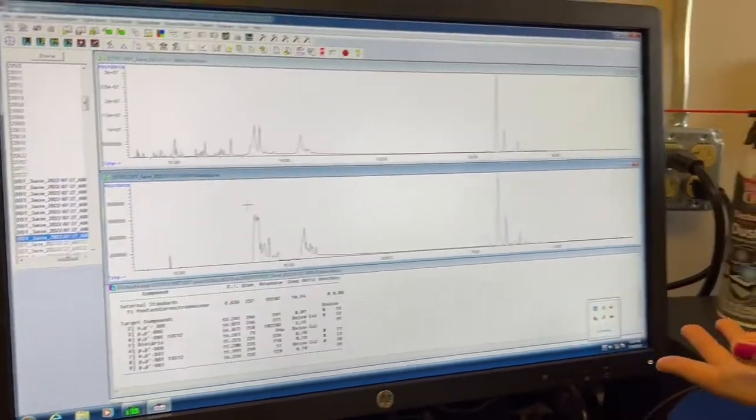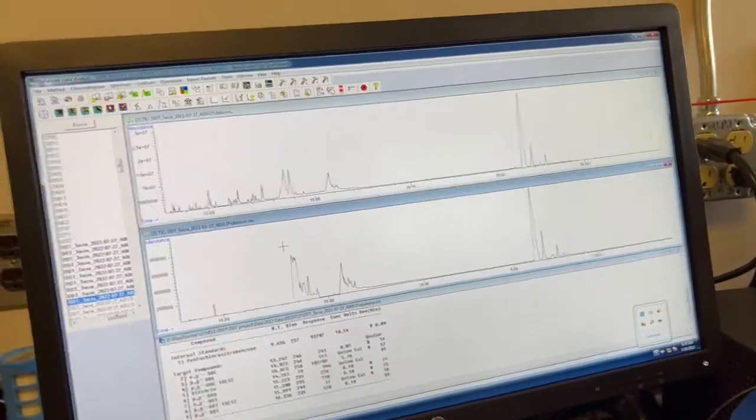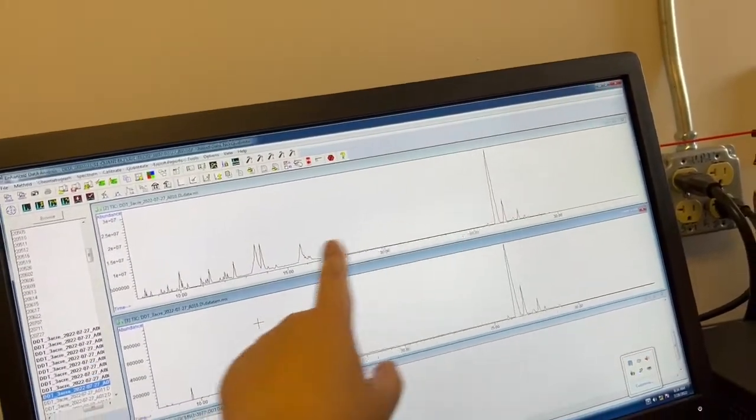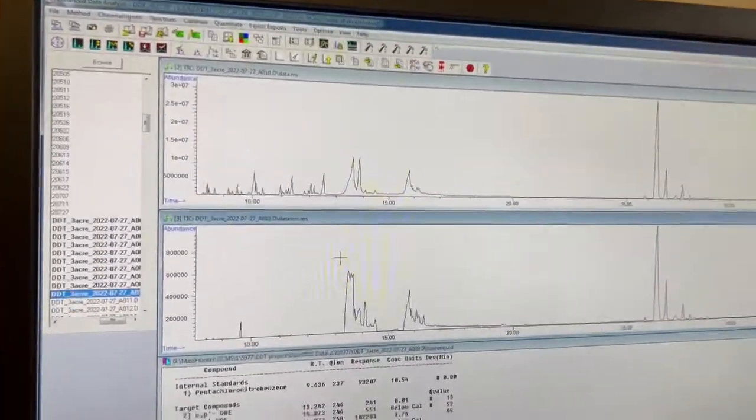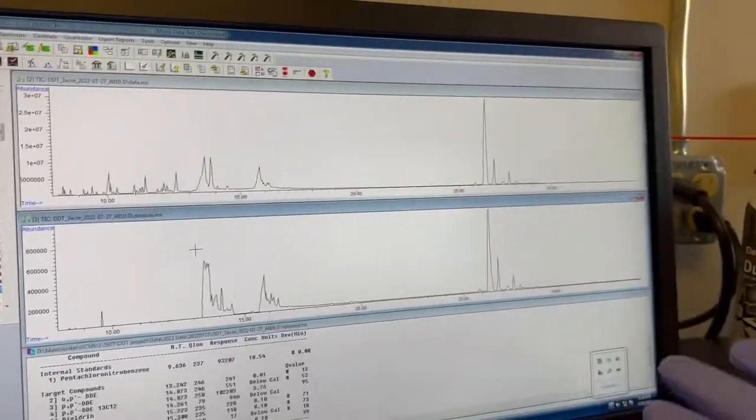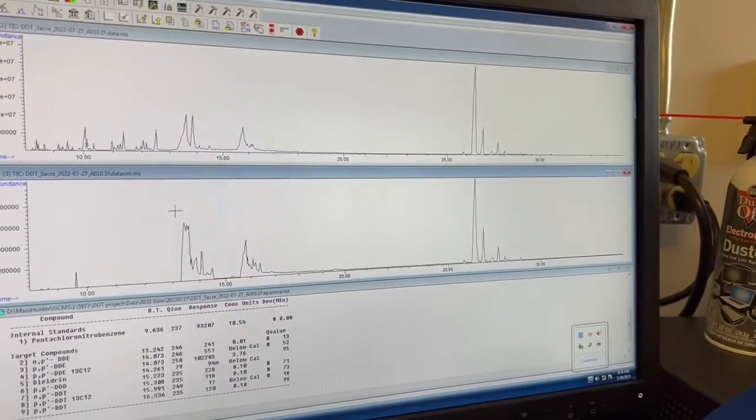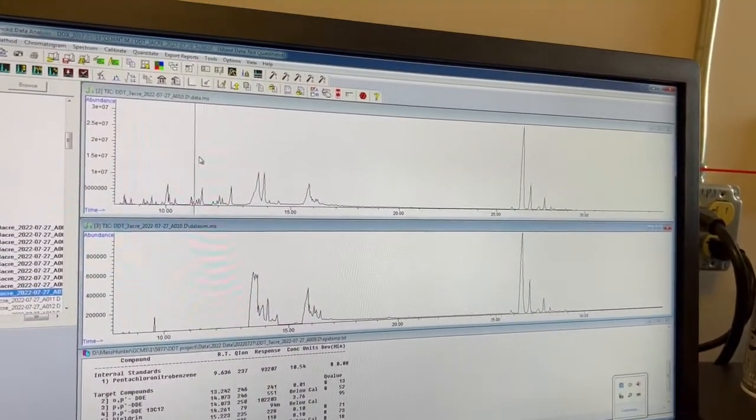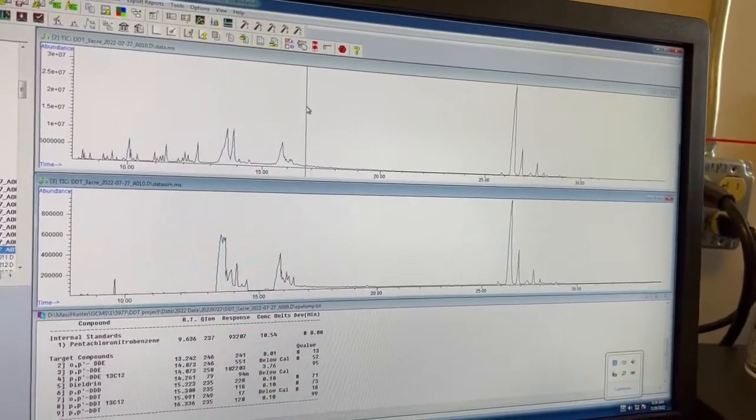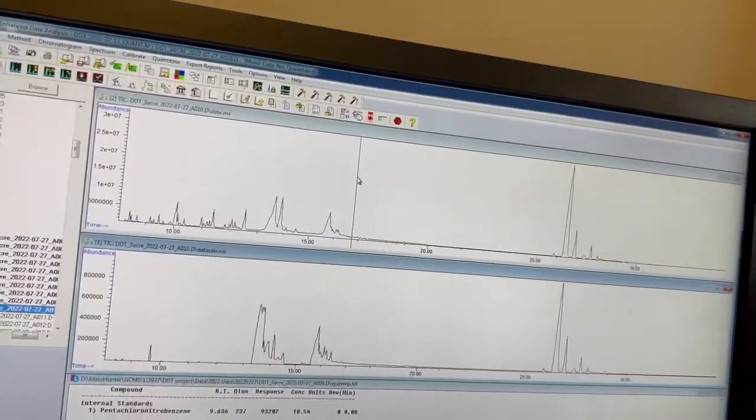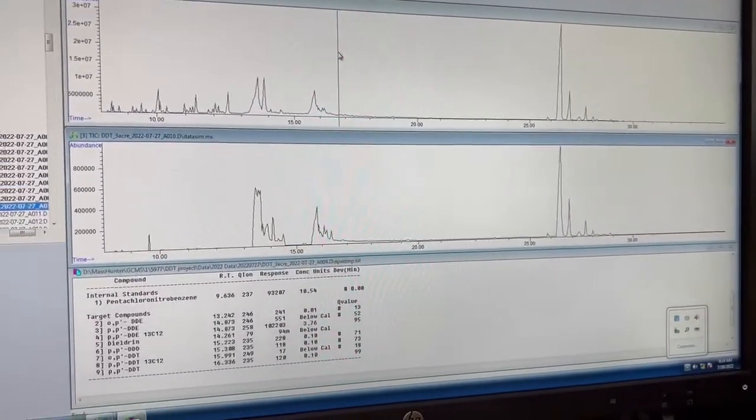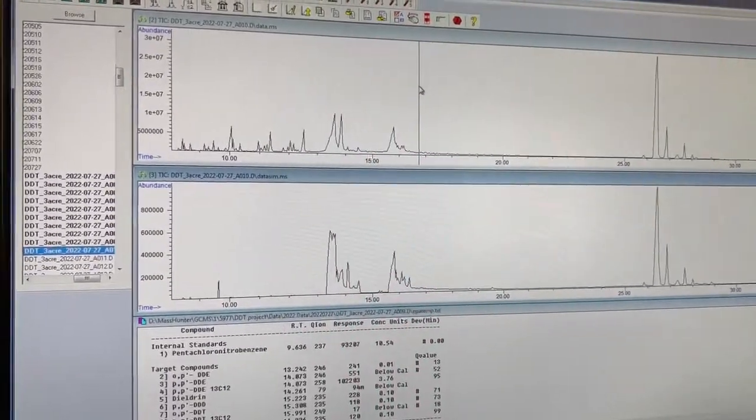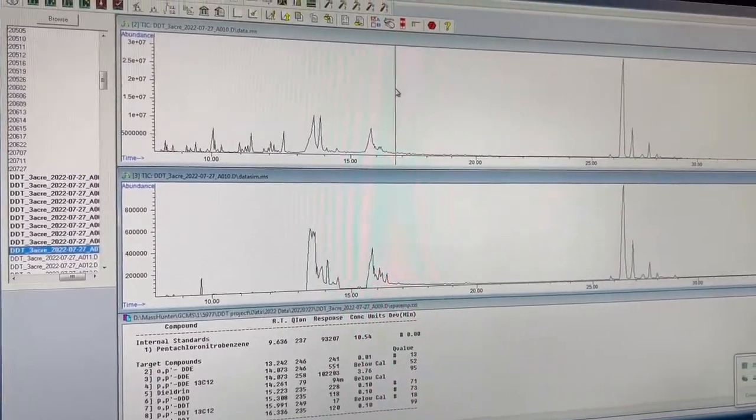And it's got lipids. That's why it looks like this. You can see there are many peaks. So the first window and the second window just show what's up to this. So I think this is a scan up here. So a scan is, there's like two things that the MS does.